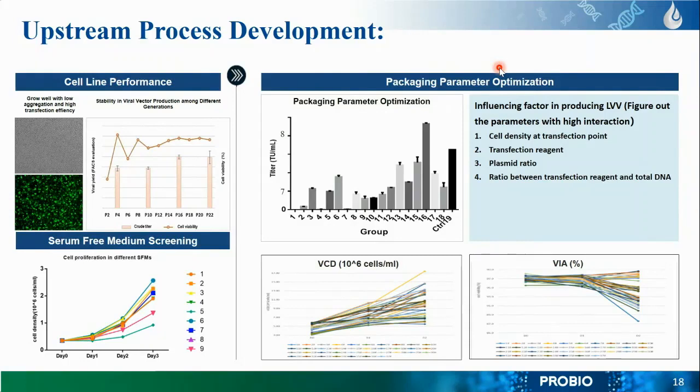The time of harvest should be determined by taking into consideration different parameters like product quality, not only productivity, and product stability.